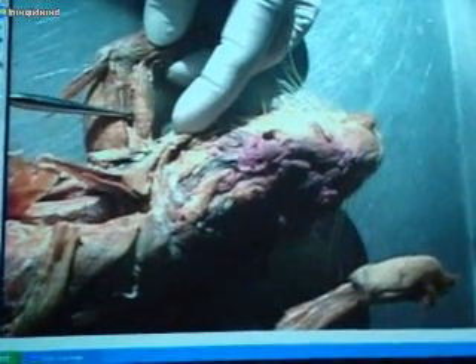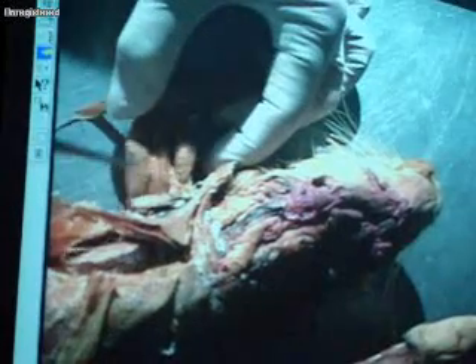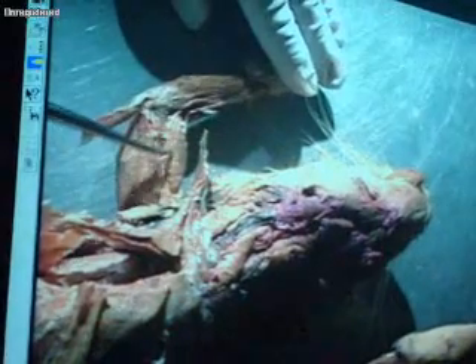This muscle right up above it, on the arm, is the biceps brachii. So epitrochlearis, lateral head of the triceps brachii, and then the biceps brachii right here that I'm pushing on — the biceps brachii.